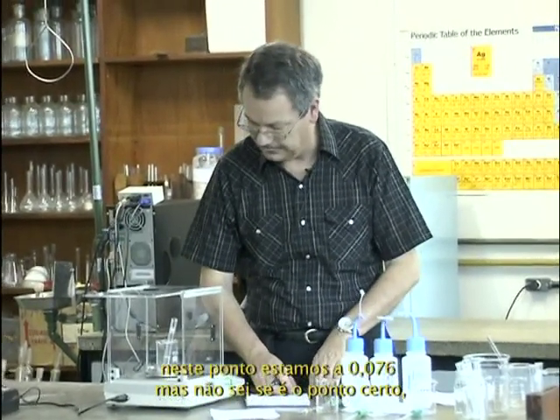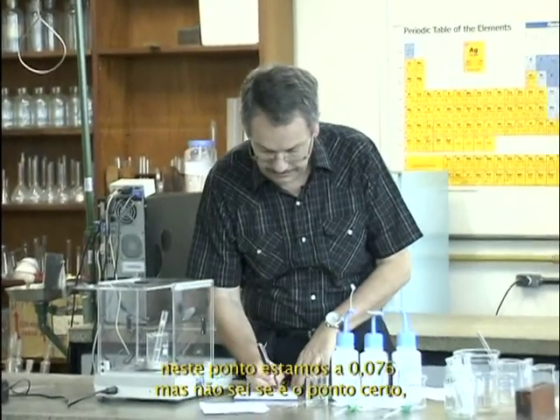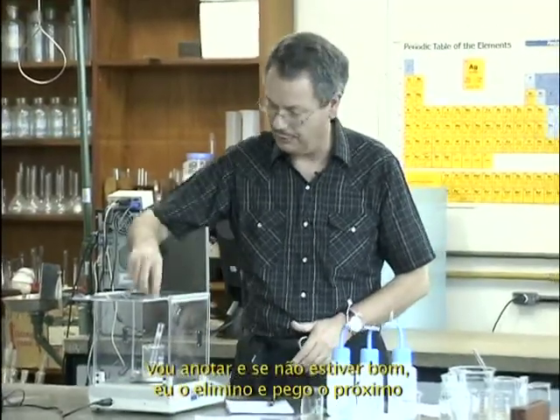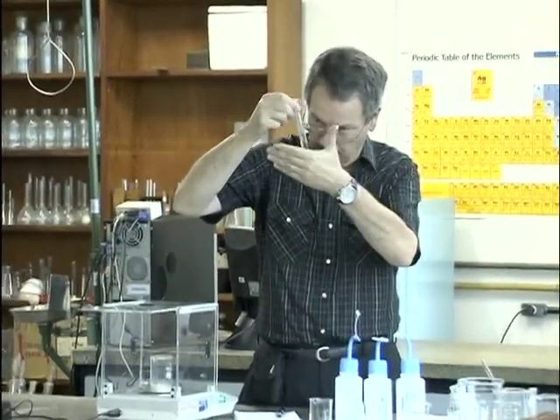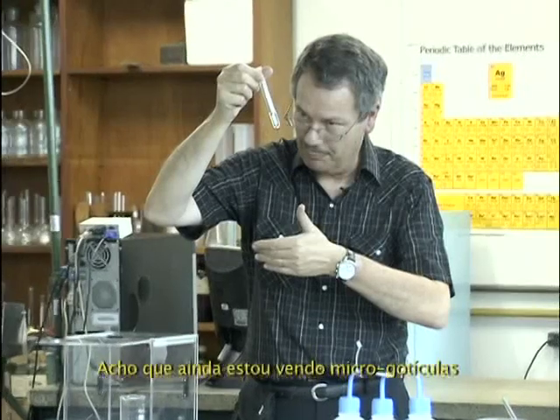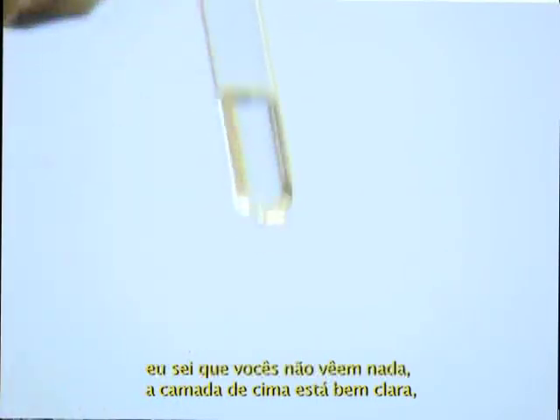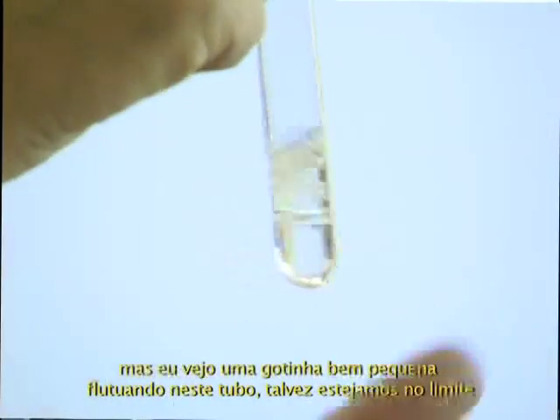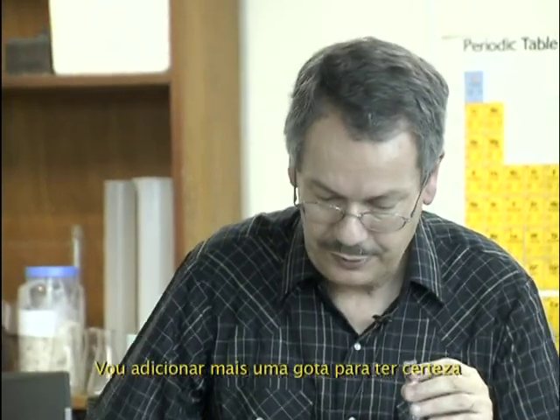At this point, we are at 0.076. But I'm not sure if it's the right point. I write it down, and if it's not good, I'll cross it off and take the next one. I think I see micro droplets remaining. I know you see nothing. The top layer is very clear, but I see very teeny droplets flowing in this tube. So I may be at the limit. I'll go for one more drop to be sure.